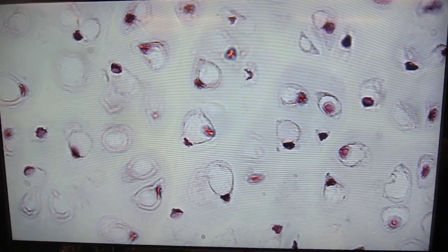The particular specimen we have here is from one of the tracheal rings. So these are the structures that hold the trachea open. Make sure we have a nice open airway, low resistance for air passage. We also have hyaline cartilage in the costal cartilages of the ribs, at the tip of the nose, and at the surfaces of our bones and our synovial joints. Okay, to name a few other locations.